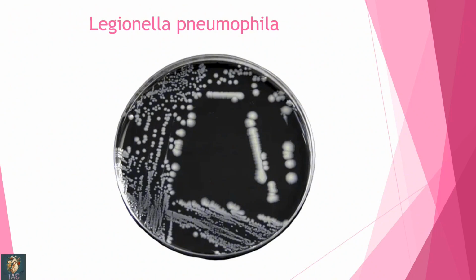This Legionella pneumophila can be grown on a specific agar. This agar is known as buffered charcoal yeast extract agar, BCYE agar. You can appreciate the color of charcoal over here. These are the colonies produced by Legionella pneumophila, gray-white colonies, round and smooth.